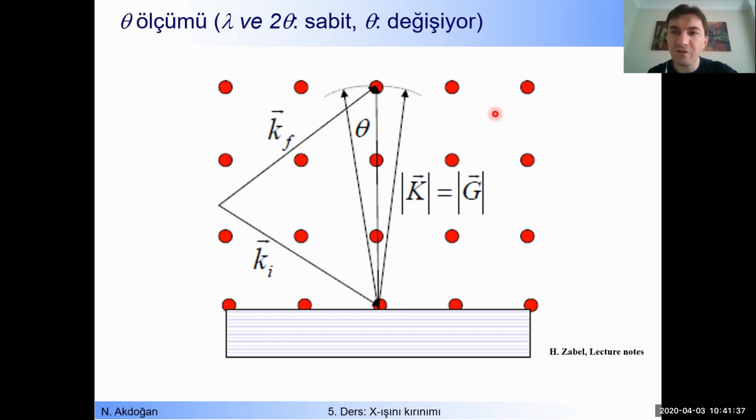Which peak, which signal comes from the substrate, which signal comes from the thin film, okay? And what the shape of the signal or the shape of the data tells us, and how to analyze the data by using Bragg's law and by using the information of X-ray intensity read by the detector. We will talk about all these things during the next lecture.